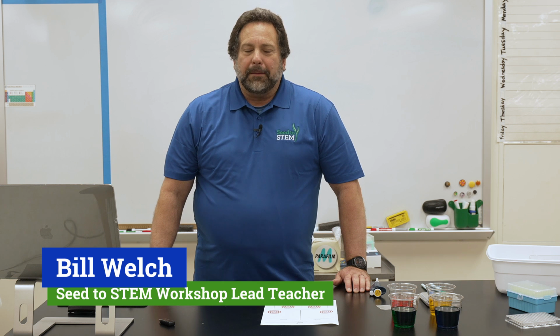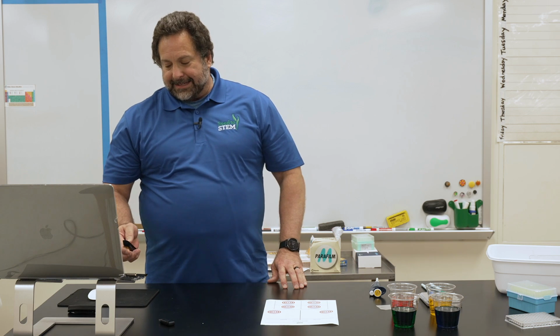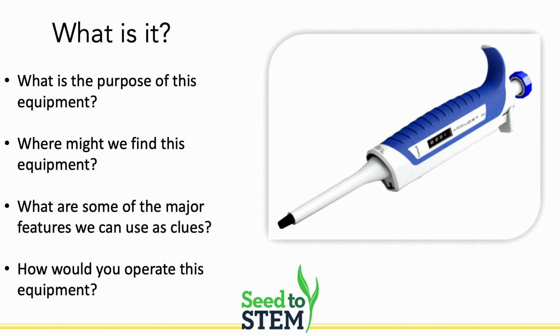Hi, I'm Bill Welch. Today I'm going to walk you through the pipette technique lab produced by Kansas Corn Stem. Now, the purpose of an activity like this is pretty simple. Looking at an object like this, we're looking at a pipetter. In a lot of the high school labs nowadays, you're going to see this instrument, and it's important that teachers and students know how to use this correctly.